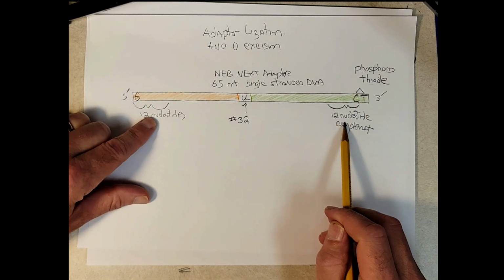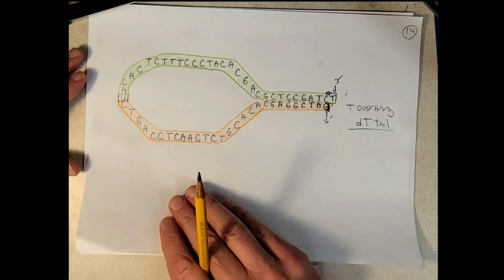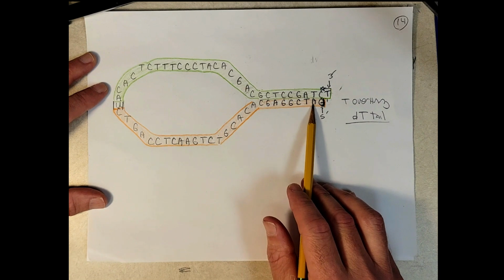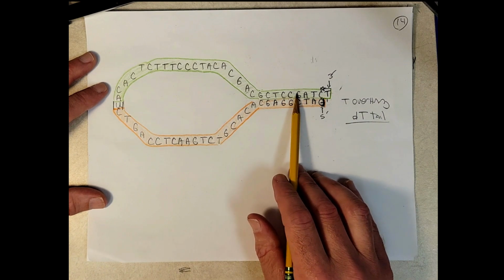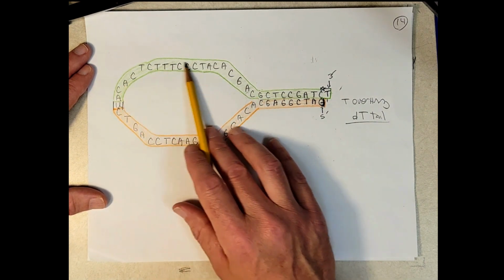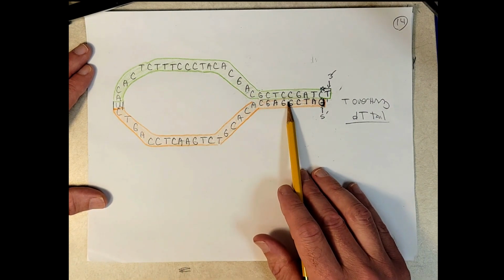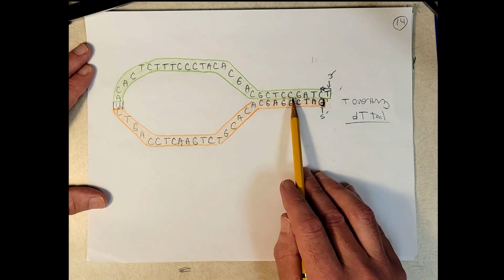So these complementary nucleotides are important. And I cheated a little bit, and I have this already diagrammed for us. When this is in solution, because of the complementary base pairs between those 12 nucleotides at the 5' end and the 12 nucleotides at the 3' end, we get this structure that looks like this. We have this little stem right here and a long hairpin. The adapters will form this secondary structure with hydrogen bonds forming between these complementary nucleotides here.